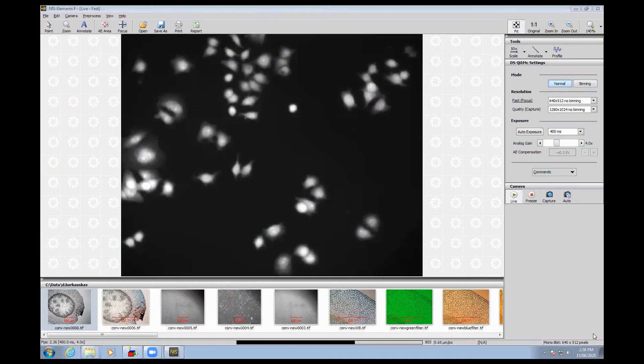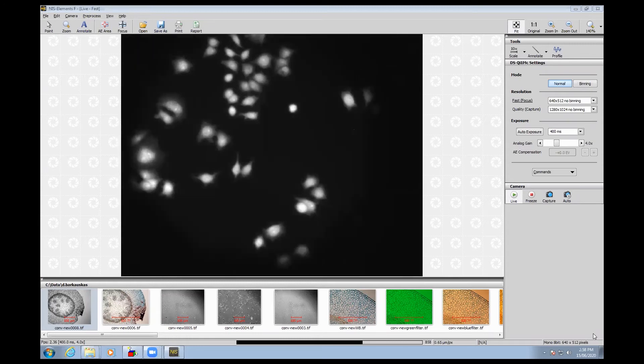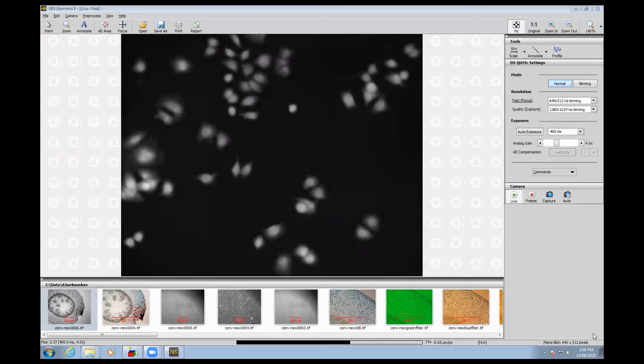First, adjust the field stop so that you can just see the edges of the polygon. Now adjust the aperture stop to achieve maximum contrast.